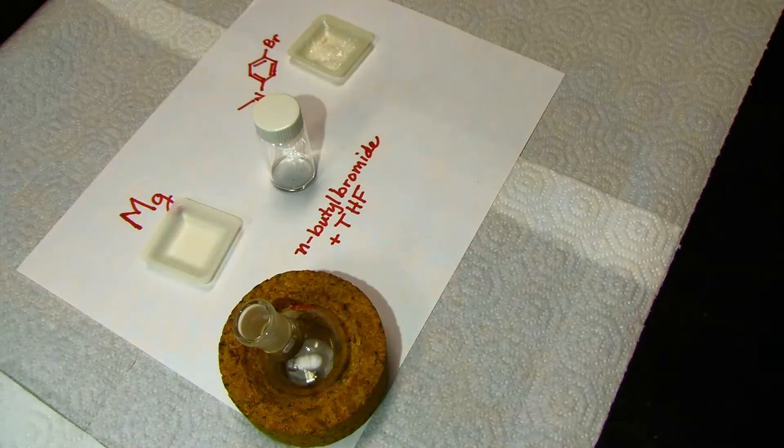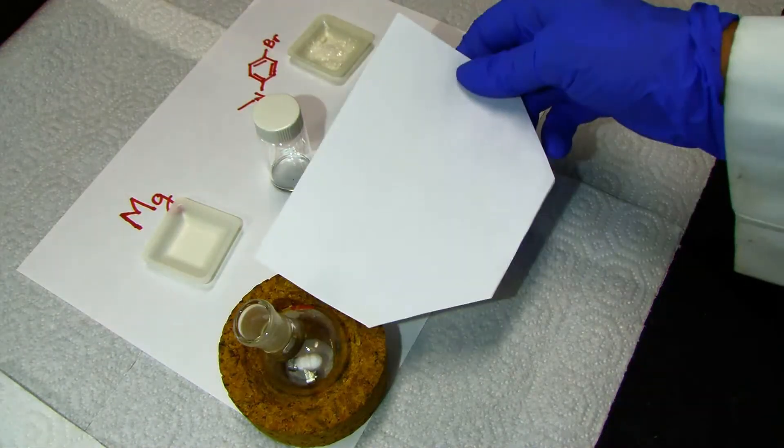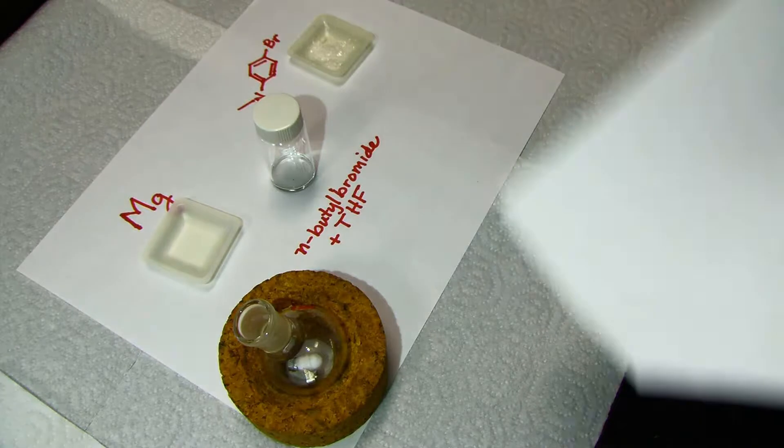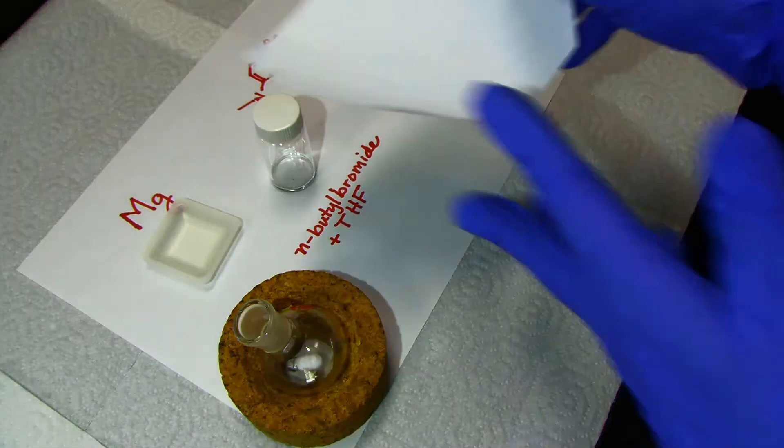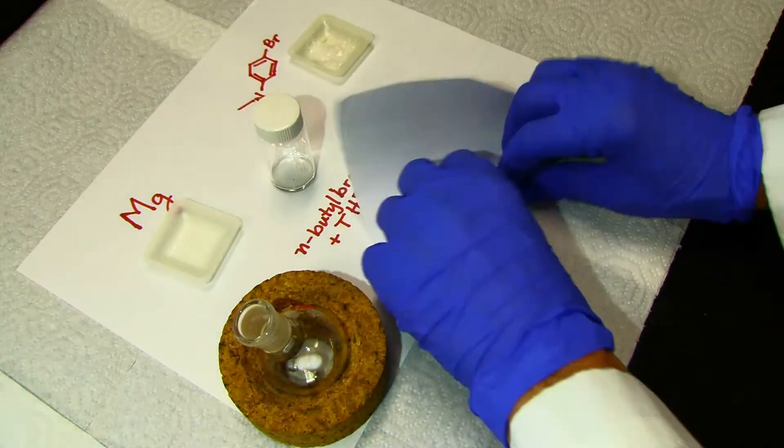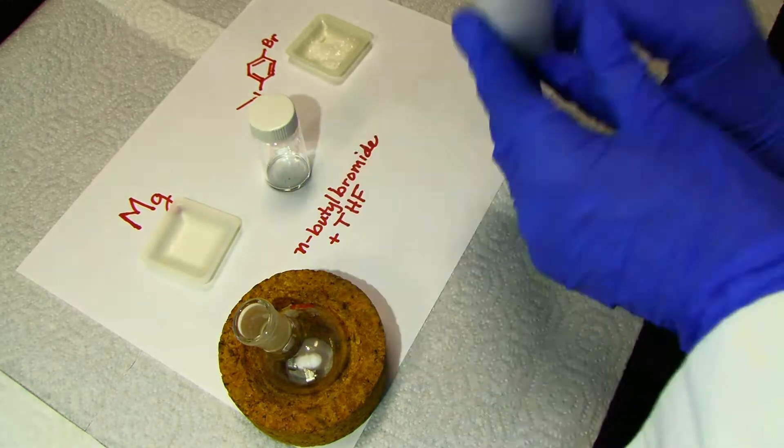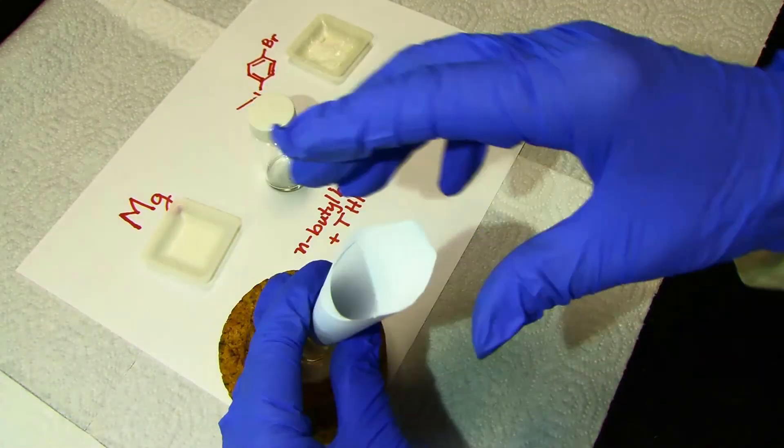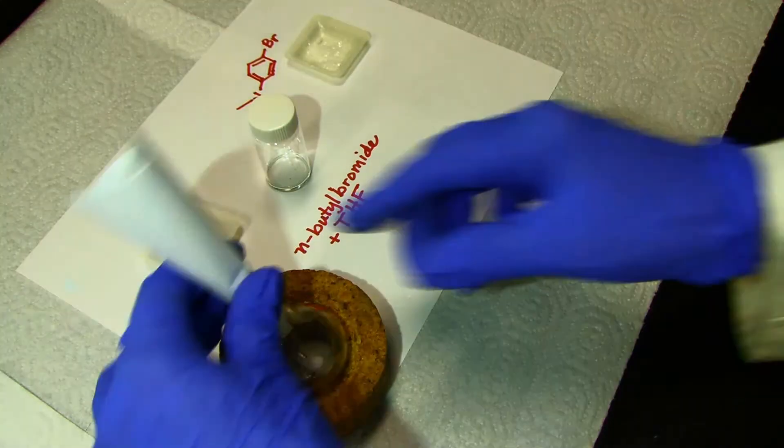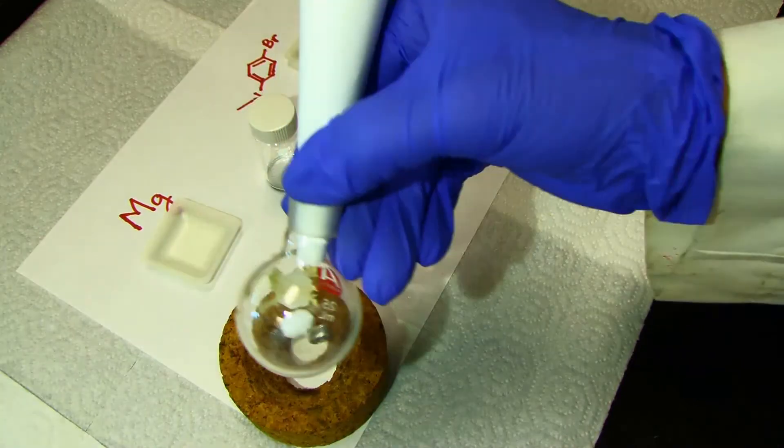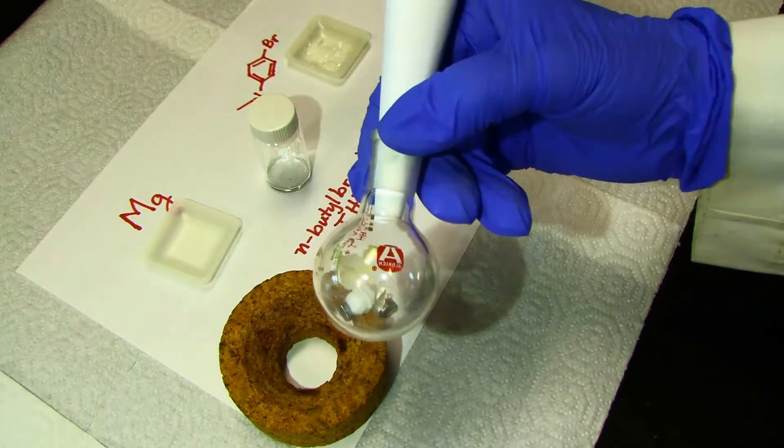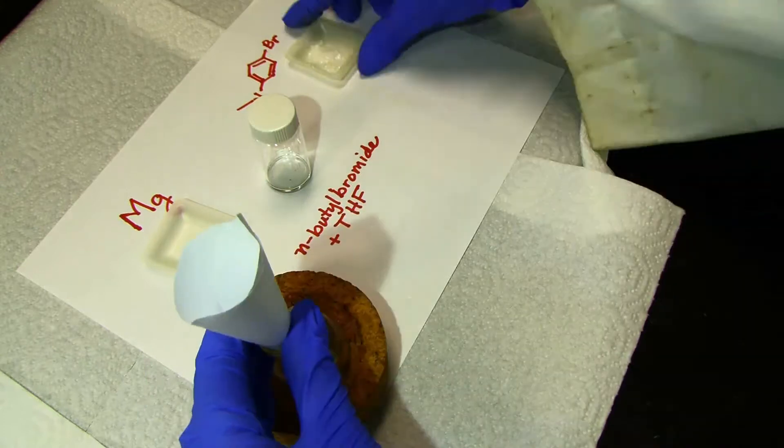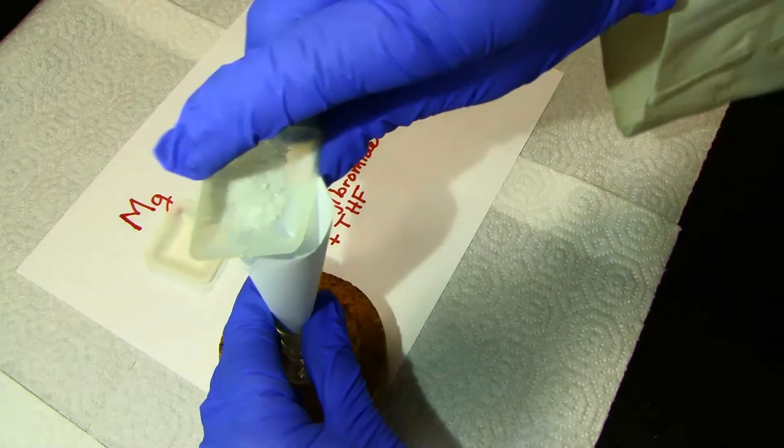My paper funnel, I make out of a piece of paper like that, cut like that, and then roll it. Take it in the flask, check that I've got it down underneath the joint. Then add my solid.